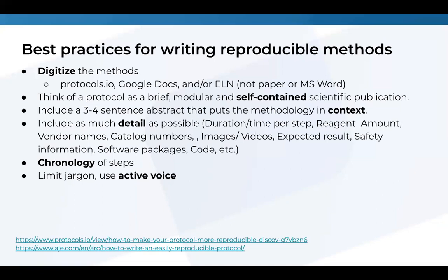And also it's really helpful to use active voice. So let the reader know exactly what they have to do instead of saying what has been done to the sample.